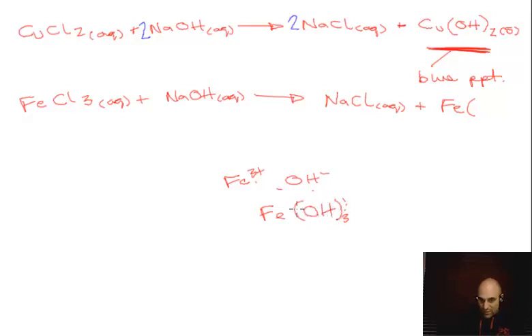But what I want to show is I have 3 hydroxide ions. There's an imaginary 1 here that you don't write, so it's Fe(OH)3. This is a metal hydroxide. Only group 1 metal hydroxides and group 2 a little bit are soluble. So there's my precipitate. And this is my red-brown gelatinous precipitate.